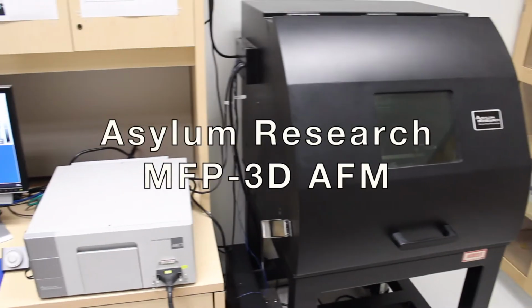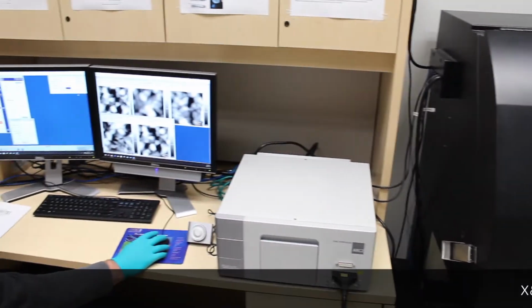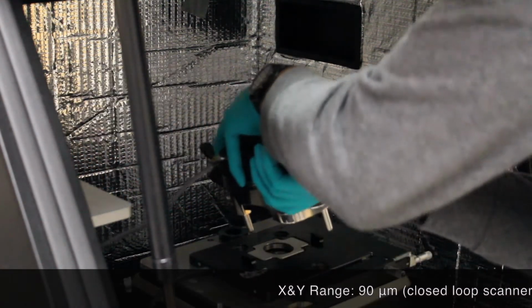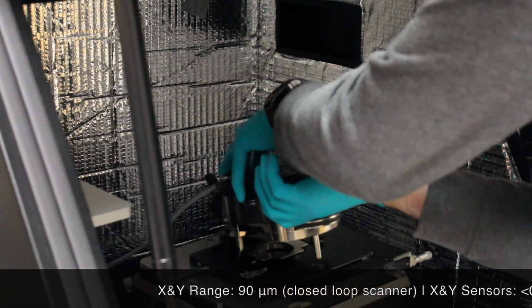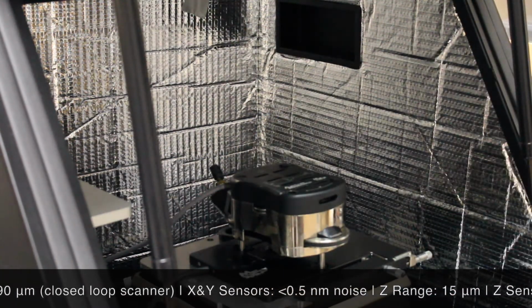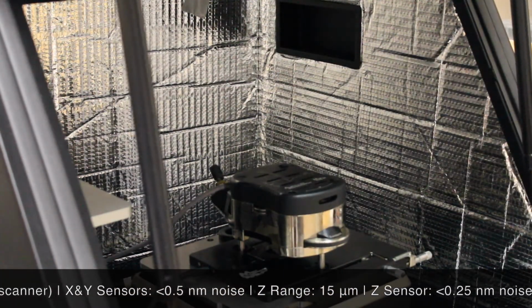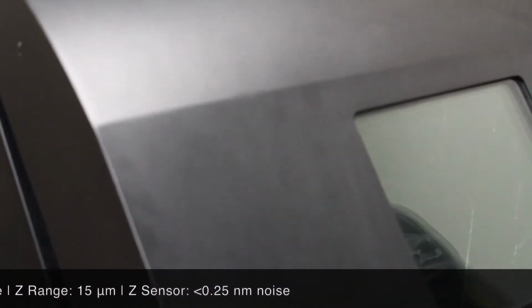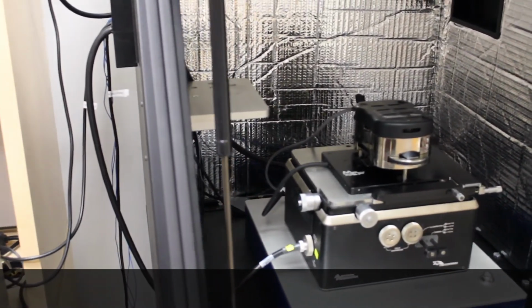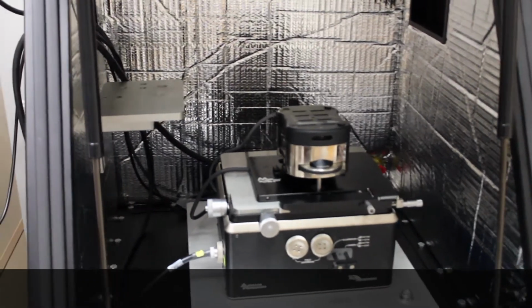Our atomic force microscope, or AFM, is used to image materials and study their various properties on the nanometer scale. In addition to standard imaging, different modes of operation, AC, contact, lateral force, and phase imaging, enable users to perform scanning Kelvin probe microscopy, electric force microscopy, and magnetic force microscopy. The instrument has a dual view base for both opaque and transparent samples, and has a bioheater and a polymer heater accessory.